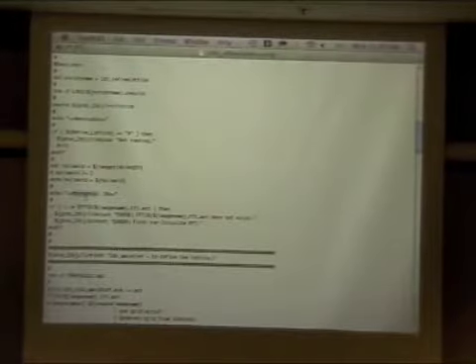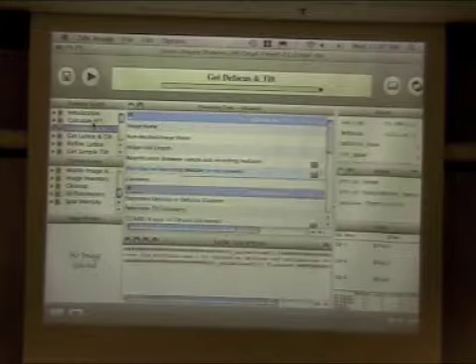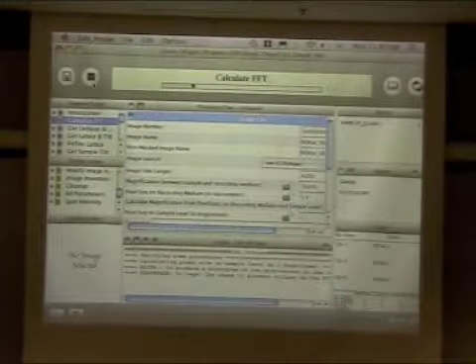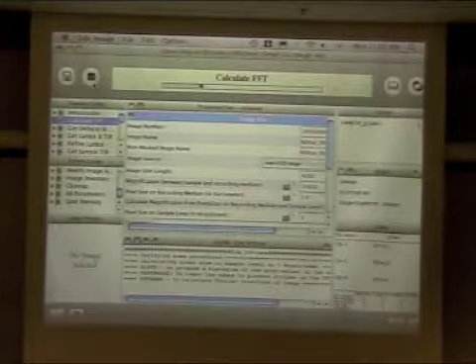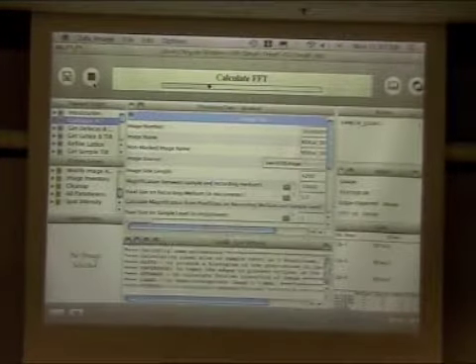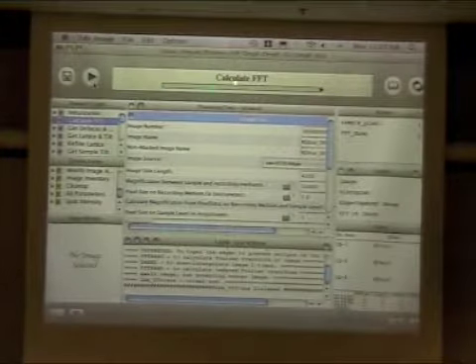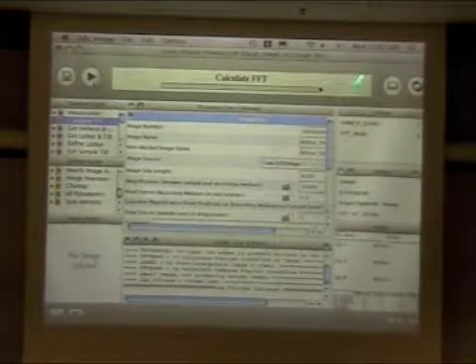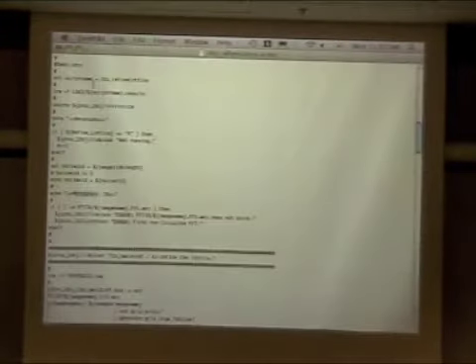Progress, this little progress bar that you see up here at the top of the screen, if I were to just do something simple like calculate an FFT, you can see that that's just marching across diligently. That's totally controlled by the script. So if you've got something that re-refines a few times, you could, in principle, march up to here, go up to here, back forward, and so on, and then finally finish up there. Again, all completely script controlled.